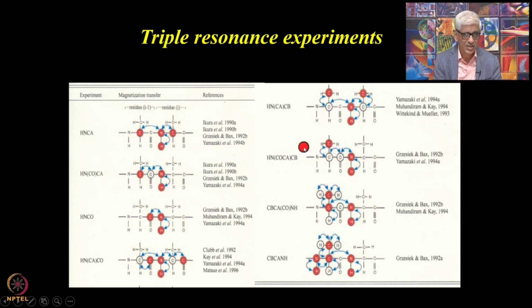Detecting means we have to have a frequency label, and the T1 increment should correspond to that particular chemical shift, and that is what determines which nucleus you are going to detect, okay. So yeah, and then the CBCA CONH, so these were the HN protons, okay. Now here what we do, we start from the C beta once again. From the C beta you come here, from the C alpha also you start here, you also start from the C beta. So both of them will come here, and from this you go to the nitrogen, and from the nitrogen you go to the amide proton, and you detect the signal here, okay.